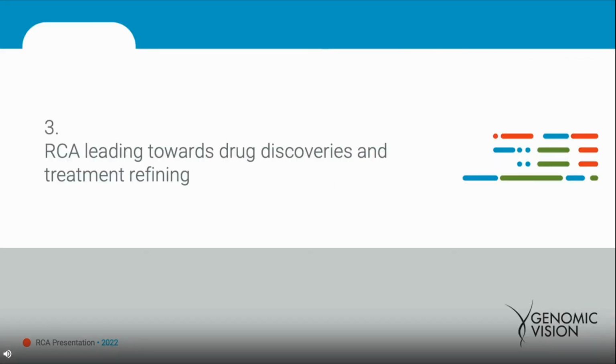We then move to the 3rd chapter of this presentation that focuses more on the application of RCA, so Replication Combing Assay, for the use of drug discovery and treatment refining.